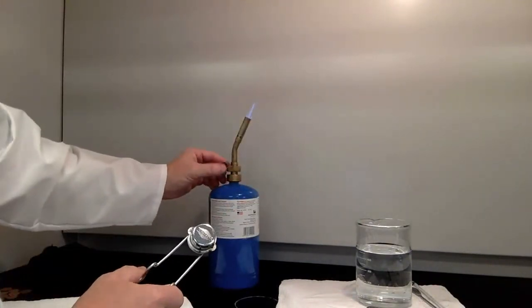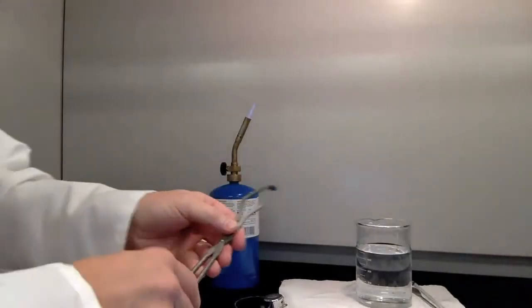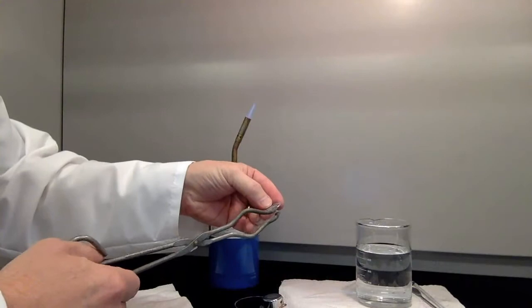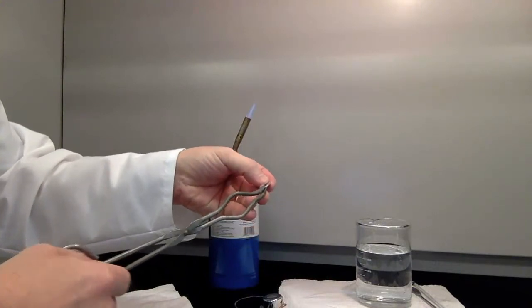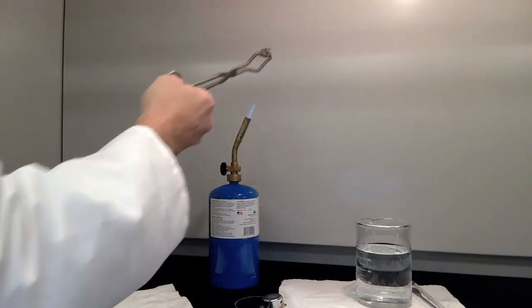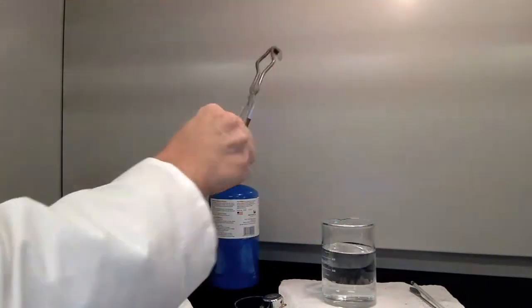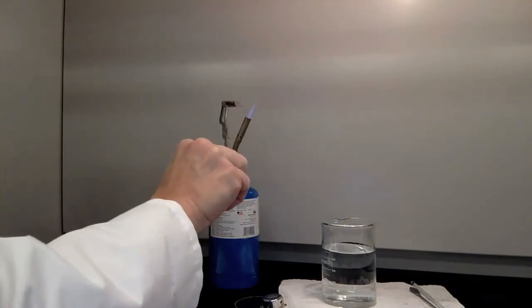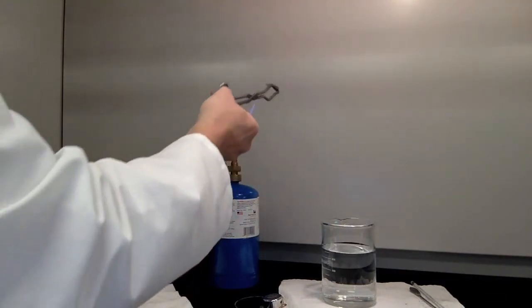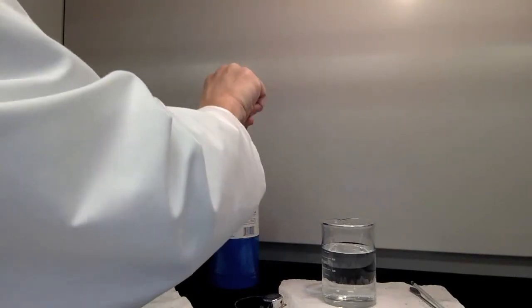I don't need very much flame, so I'm just going to turn it down to the lower setting. And then I'm going to take one of these pennies and hold it like so, and I'm going to gently heat this over the flame. Now as I do, I'm going to rock it back and forth just so I can get a good, even, consistent heating. So I'm going to rock it back and forth like so until it begins to change color.